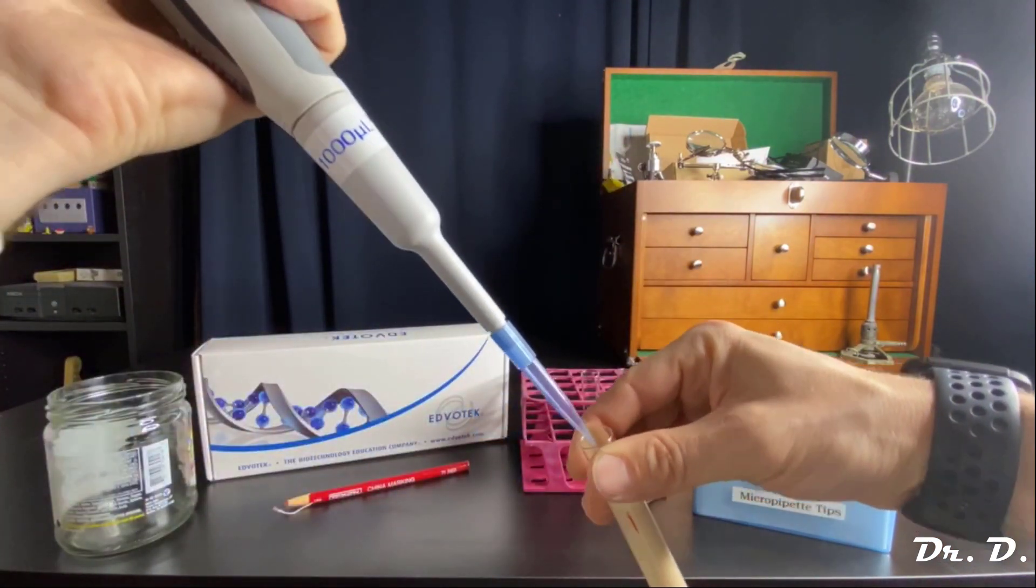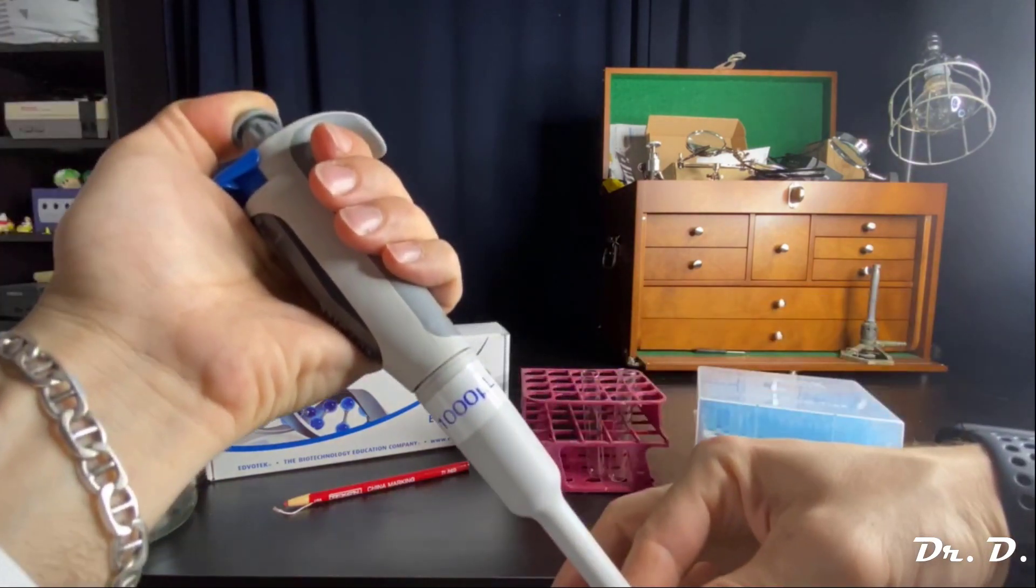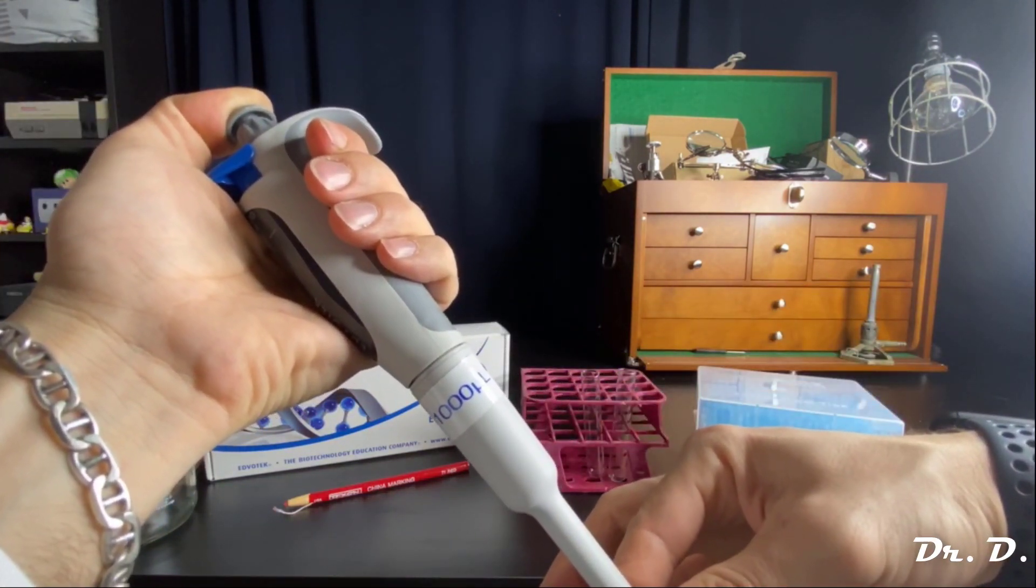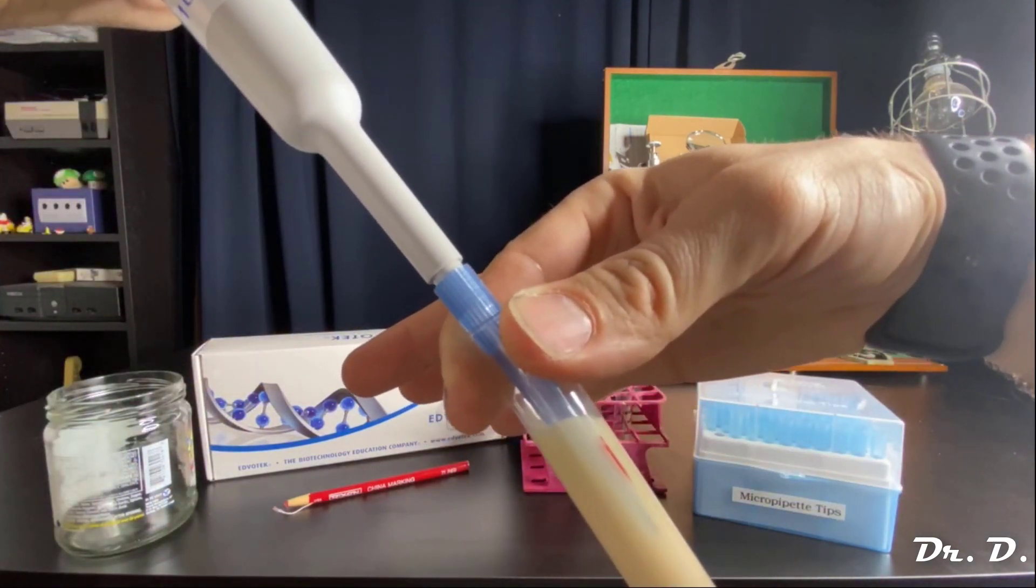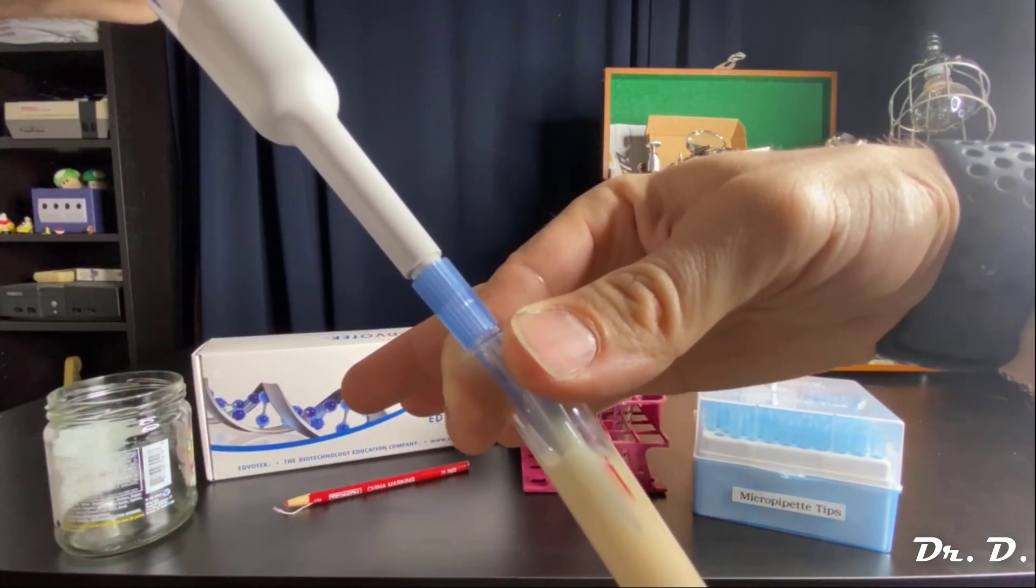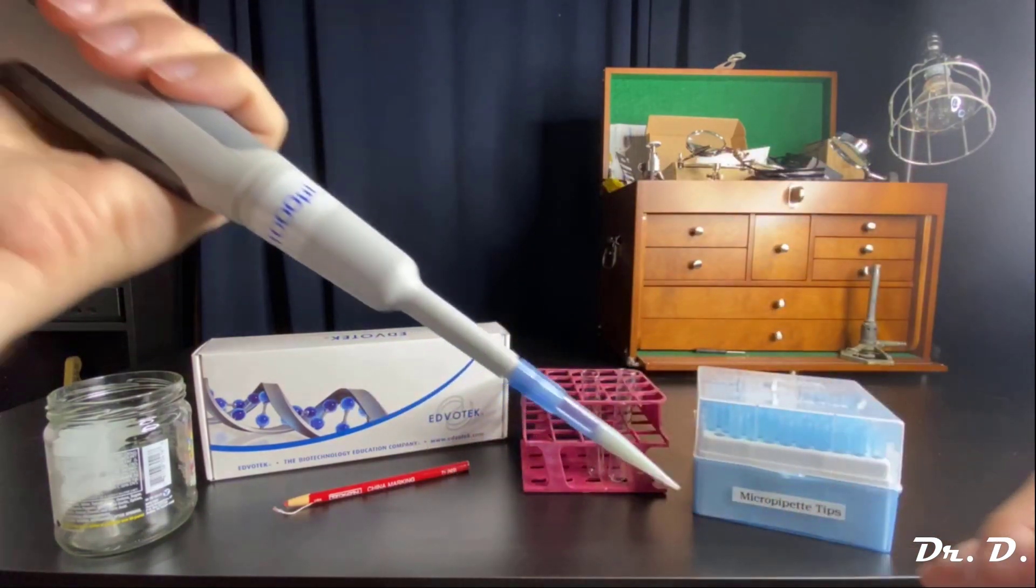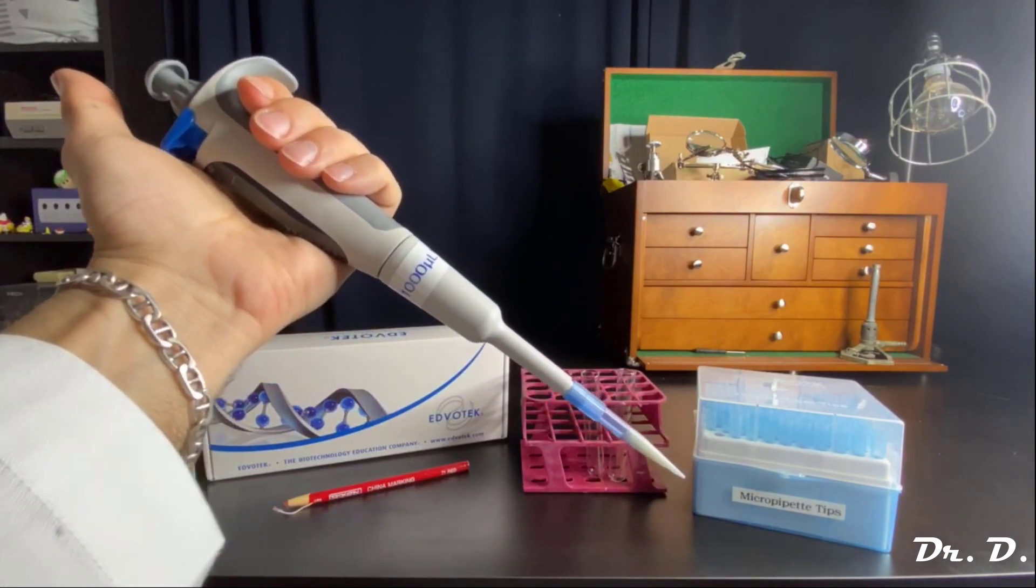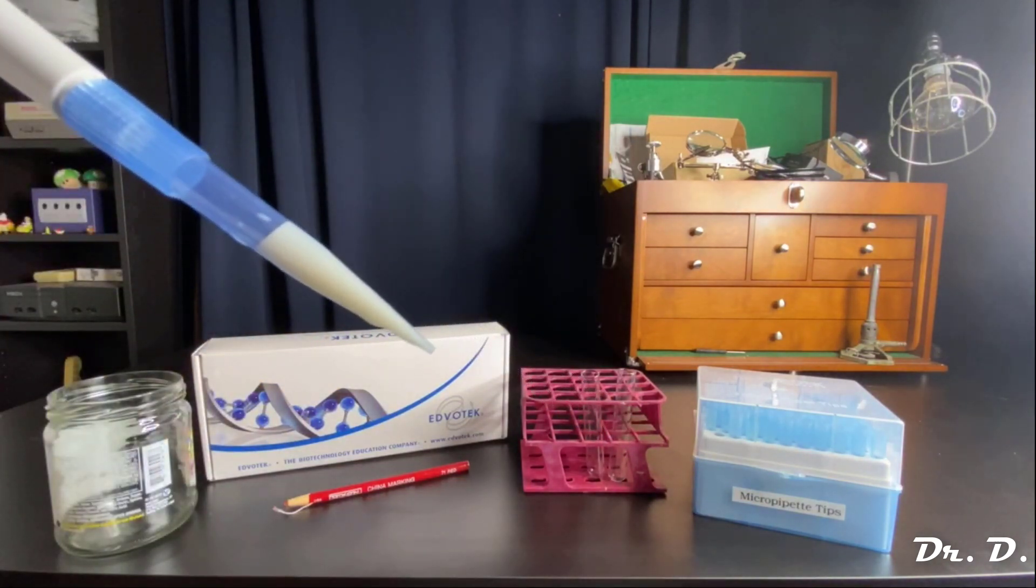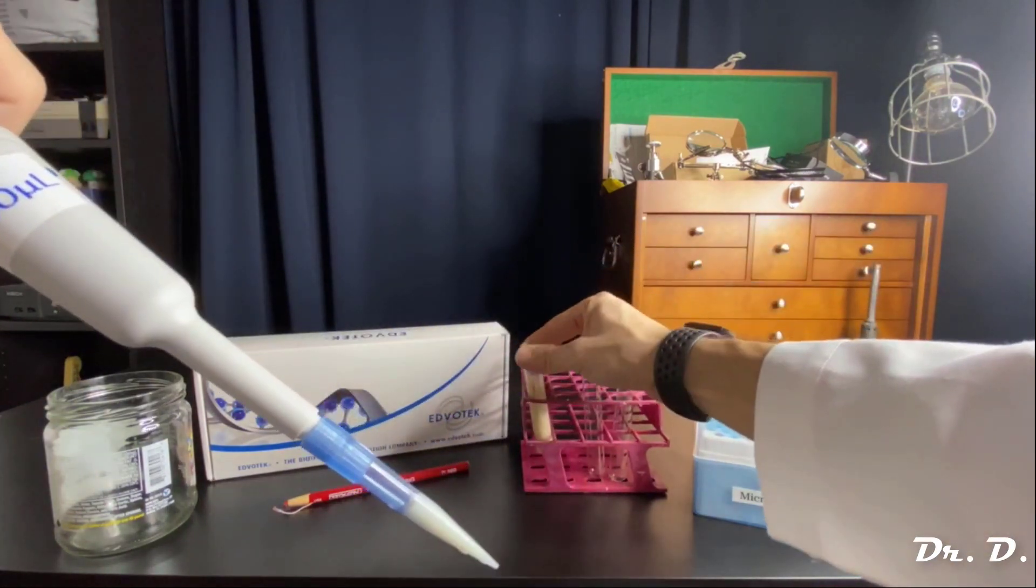I then make sure to submerge my tip into the solution. And then what do I do? Gently let go of the plunger. Gently let up. And what do I see? I slowly let up. And there you go. That's 500 microliters of solution in my tip. And you can clearly see that the solution is in the tip. So let me put test tube one down.